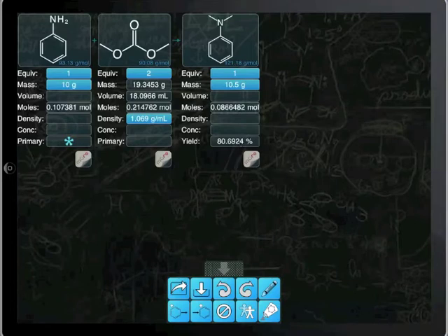So basically, the Yield101 app calculates all of the possible missing quantities based on what you provide. You don't need to work out the molecular weight. All you have to do is check to see that the structure is correct and the stoichiometry is appropriate for the reaction.